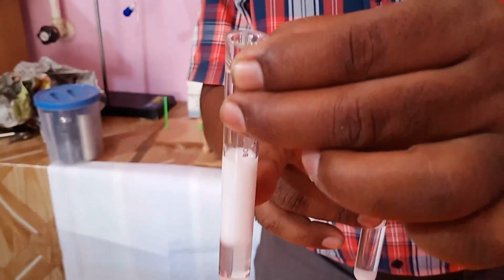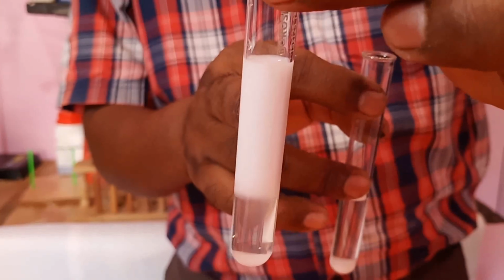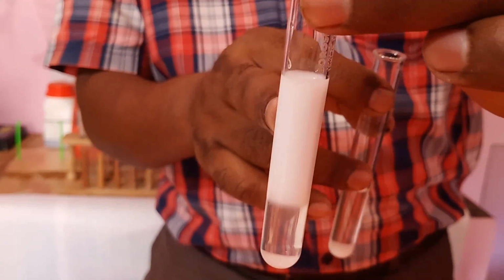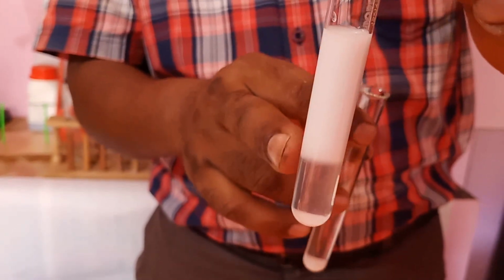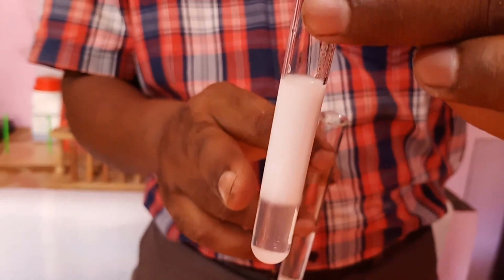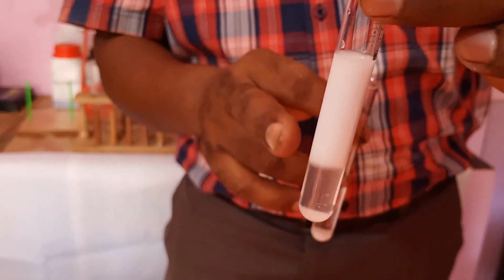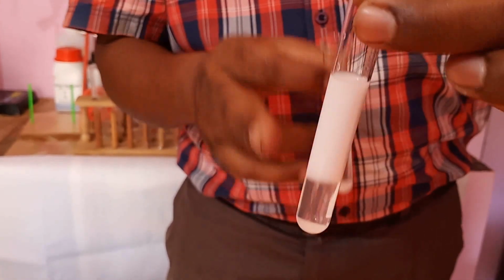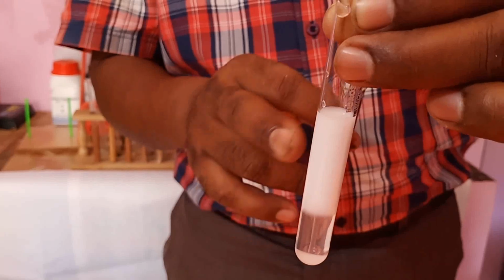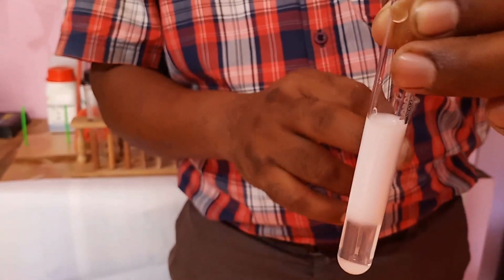Can you see, children? A layer of white precipitate is formed, which is lighter. This white precipitate is nothing but barium sulfate, and below, this is sodium chloride. So in the double displacement reaction, initially I added sodium sulfate and barium chloride. Now the double displacement took place, and we have barium sulfate and sodium chloride.